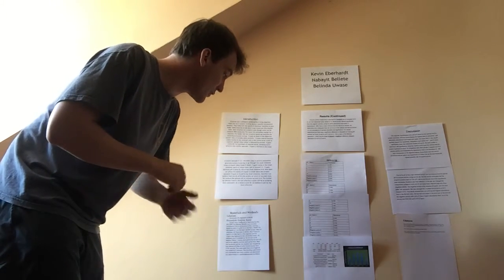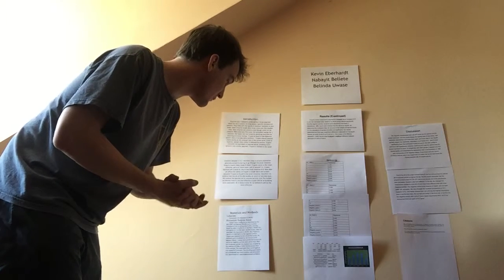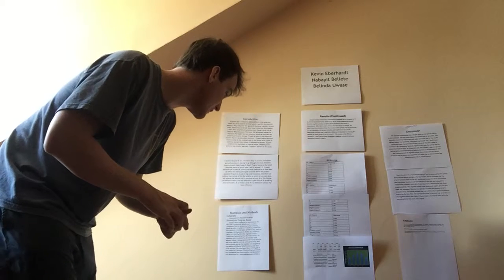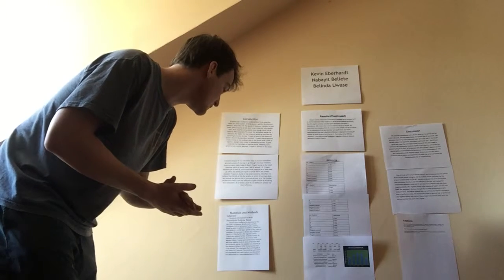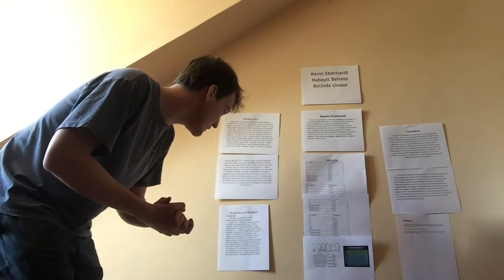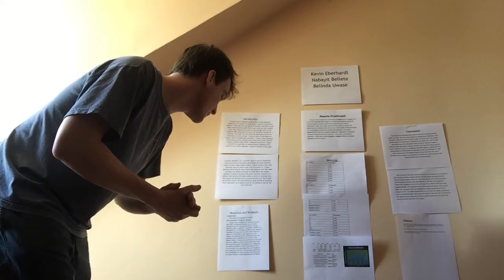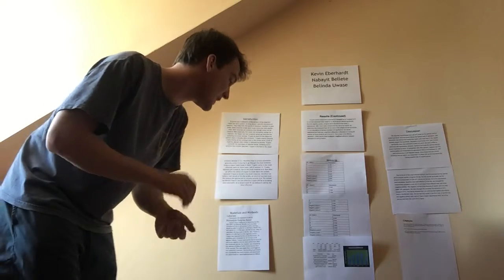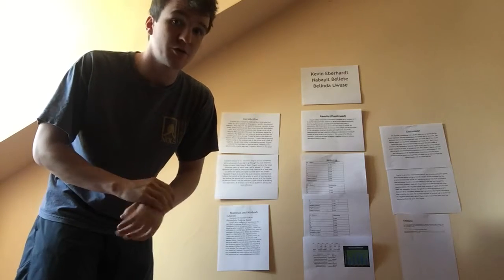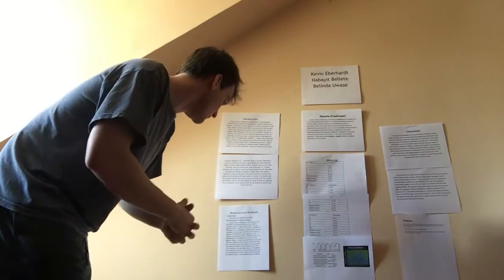So in our normal reaction, we had the reaction buffer, and we would add 50 microliters of trypsin to the azocasein substrate. In the negative control, we would add 50 microliters of water. So in that negative control, we're looking for no reaction to happen at all because trypsin is what breaks down the protein azocasein. So if we just add water, nothing should happen.